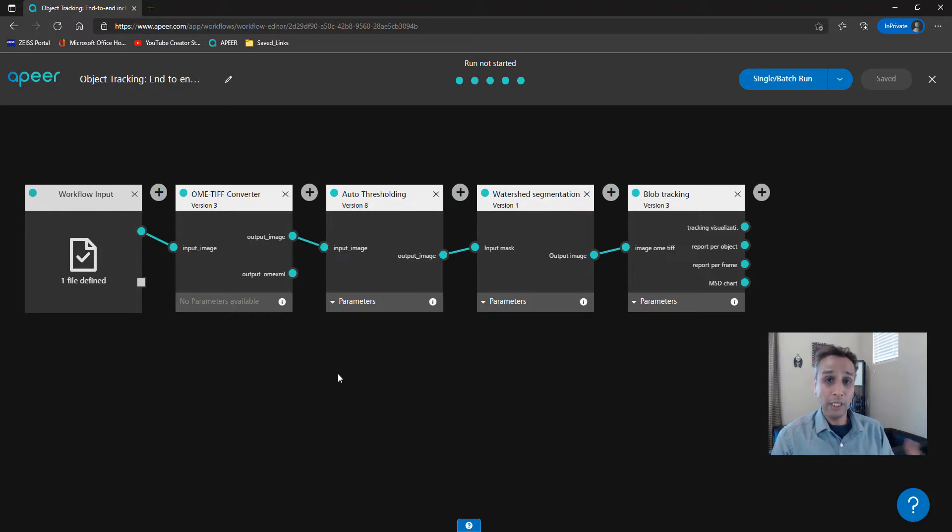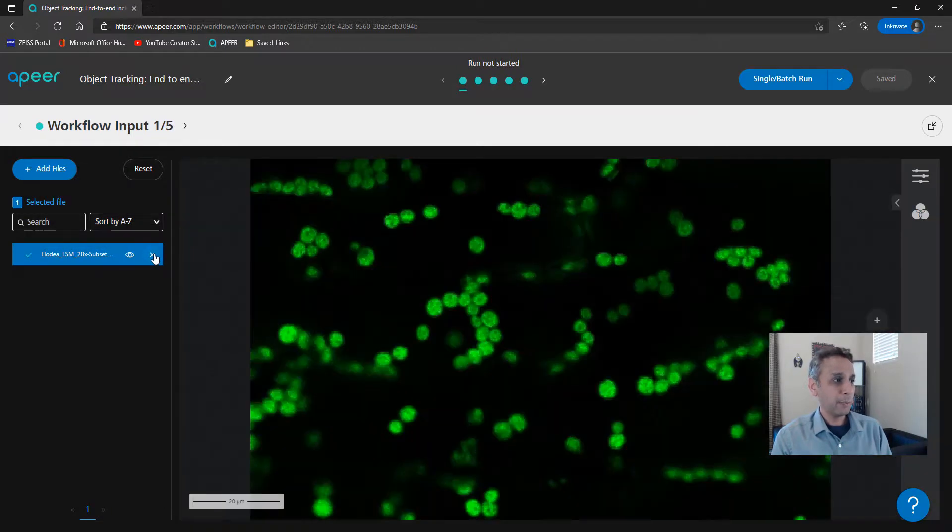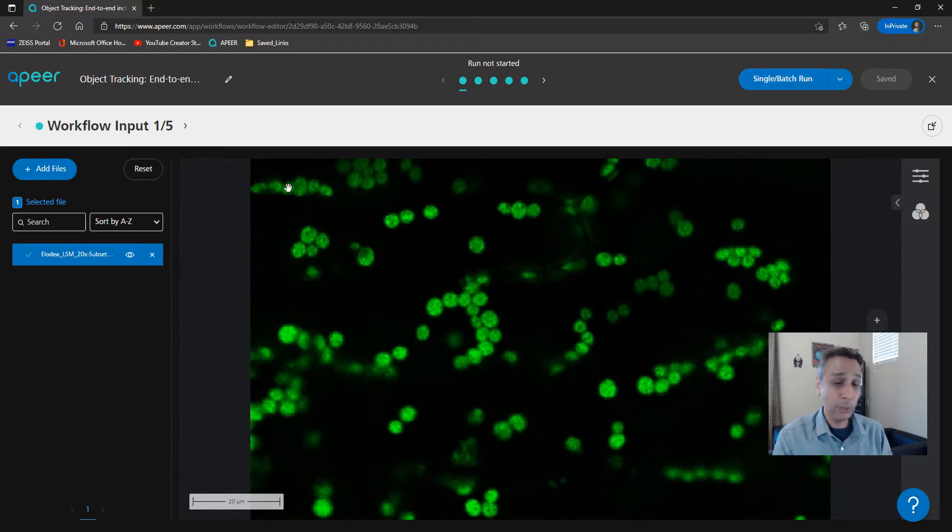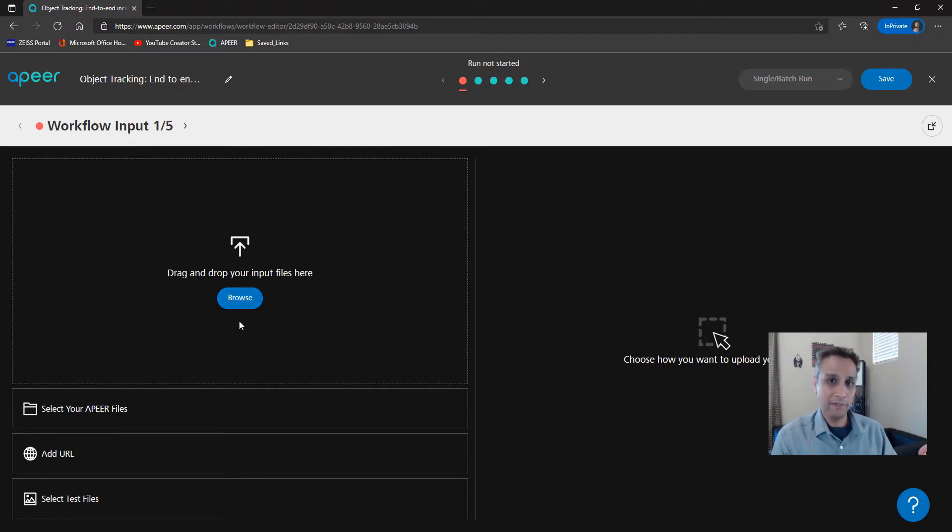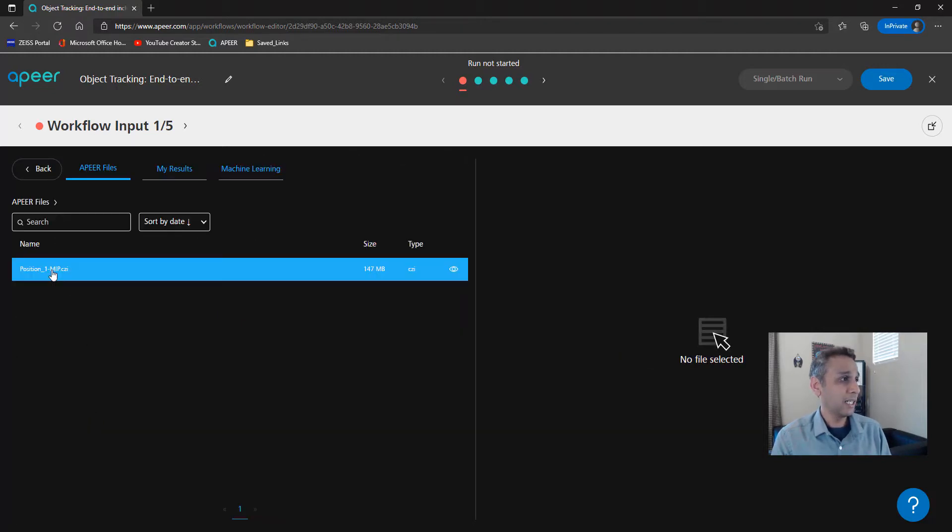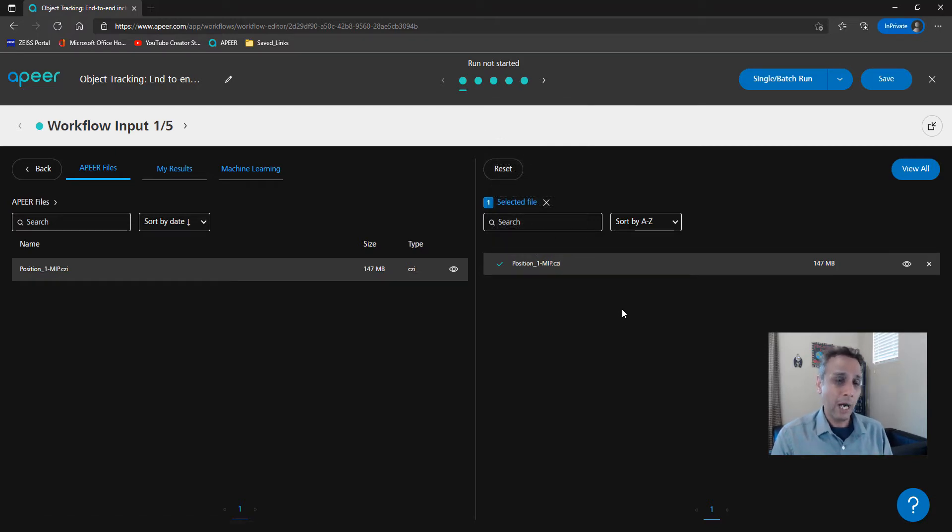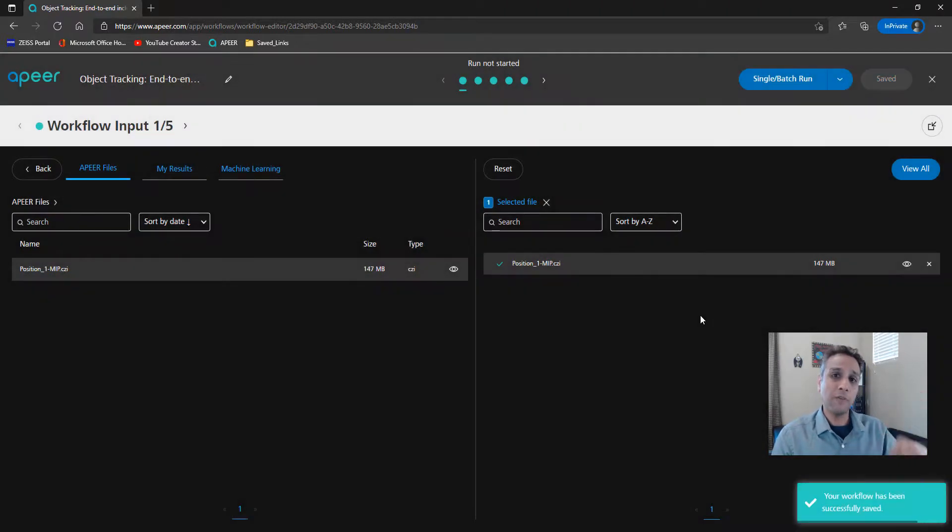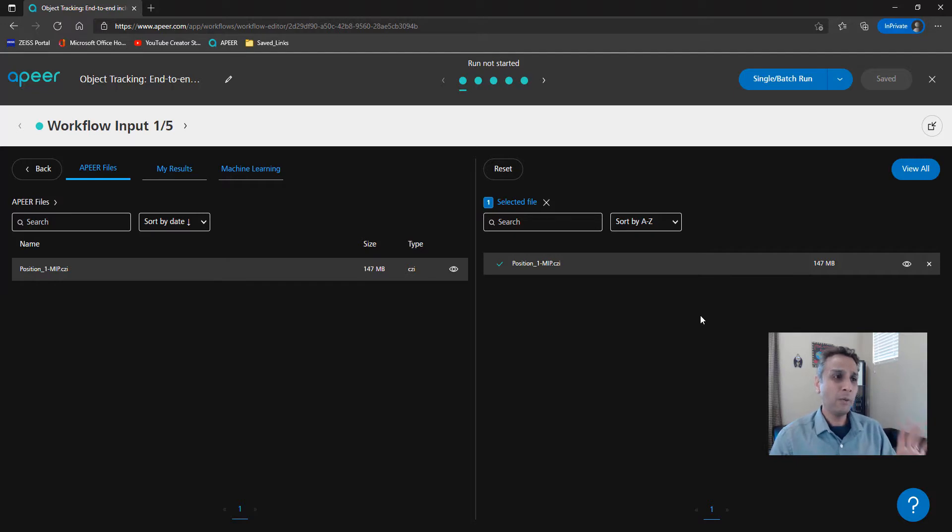Now let's run this workflow. First, let's click on the first module and remove this input because this is the default input that the workflow developer provided. You can run this and check how the output looks like if you don't have your own image. But we have our own image in this case, so let's remove that. You can upload your file here. I have already done that. It's available as part of my files. Let's go to select your Apeer files. This is the CZI image that I'd like to use as input. As soon as you hit save, this workflow gets saved as part of your My Workflow section.